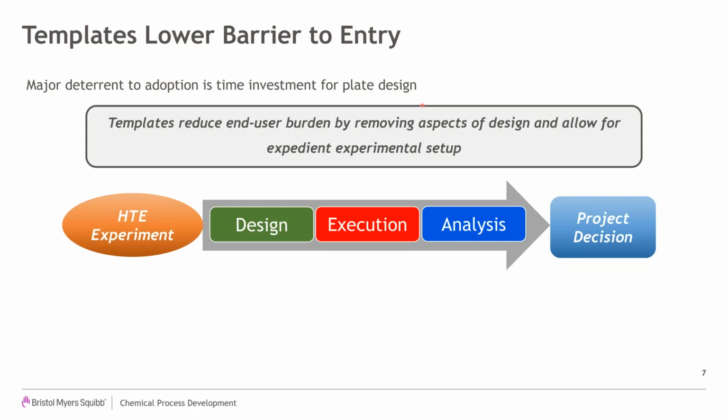And so Katalyst has the ability to make these templates, and what we're doing is we're effectively intercepting this workflow right here, right at the execution stage. So again, all of the questions that the end user might have at the design stage go away. They're already kind of made for you.